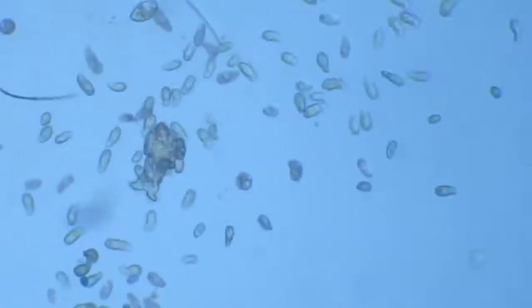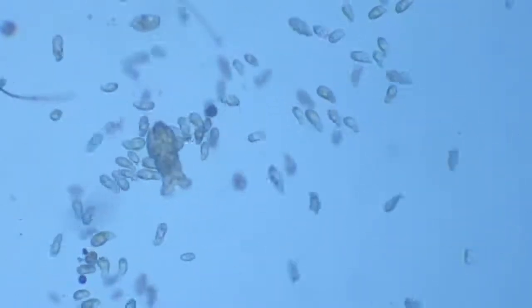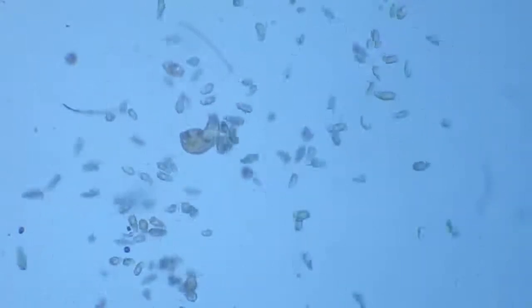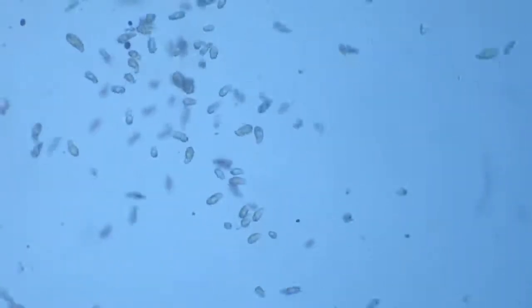We see some rotifers. This is a deloid rotifer, and this is the true corona that we know, not the corona that we are so scared of these days. So the corona of rotifers. There is a rotifer, there are ciliates, there are vorticella. These three things we have seen so far, and we sure will be finding a lot of amoebae also. But since this is a low magnification, we can't see them right away.